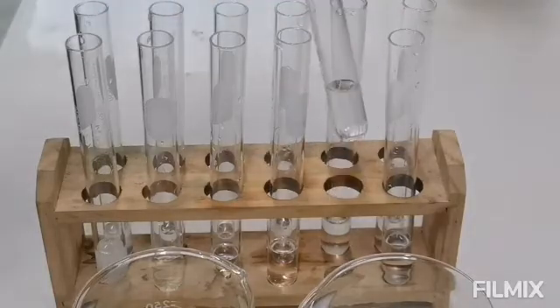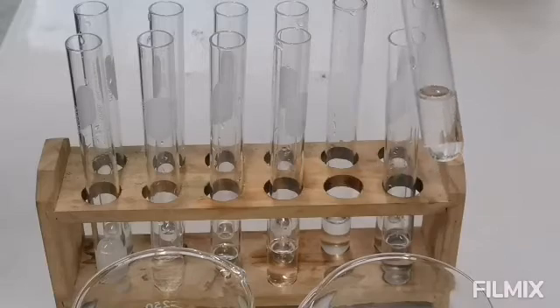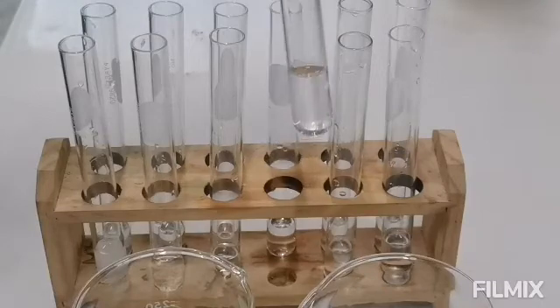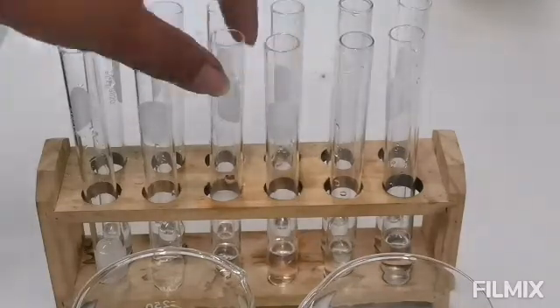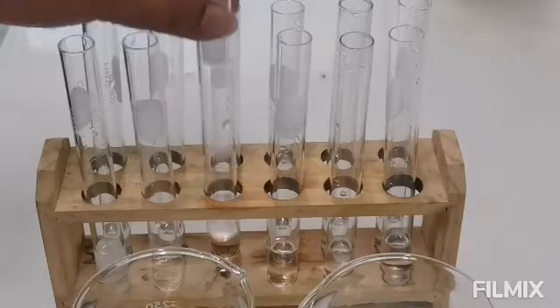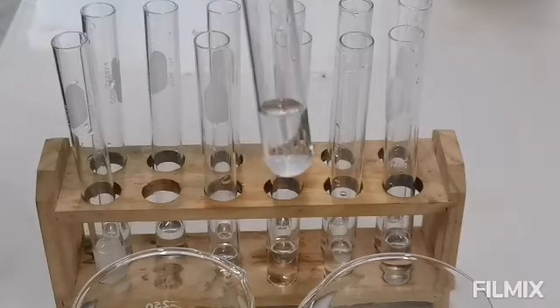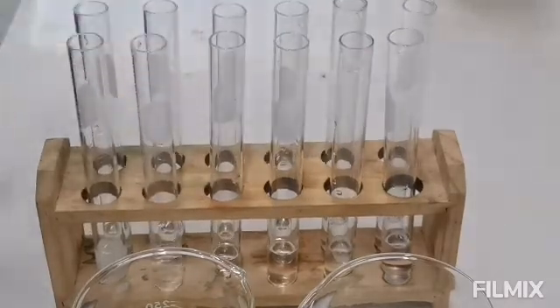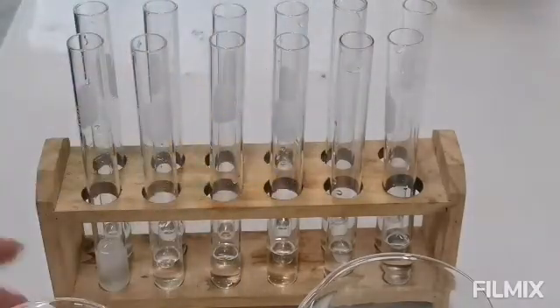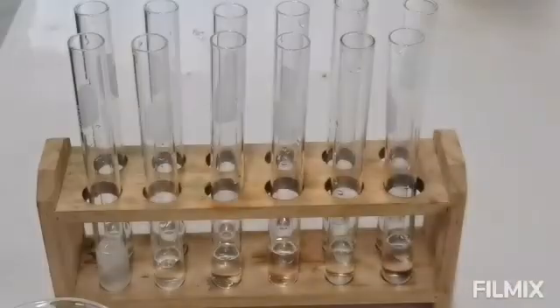Your test tube 2 is made up of sodium hydrogen carbonate solution. And then your test tube 3 is citric acid. And then your test tube 4 is ethyl alcohol. And your last test tube is your silver nitrate. So this is your beef extract. We're going to add it to the test tube, and let us try to see the possible reaction.